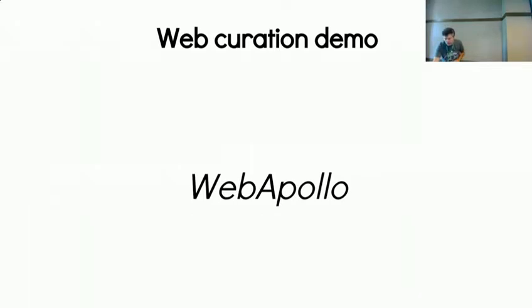This is a BAM file. So these are the sequence reads that come in. I don't know if you just saw me create an annotation off of those reads. And there's the sequence there for it. What other files do we have? We also allow variants.